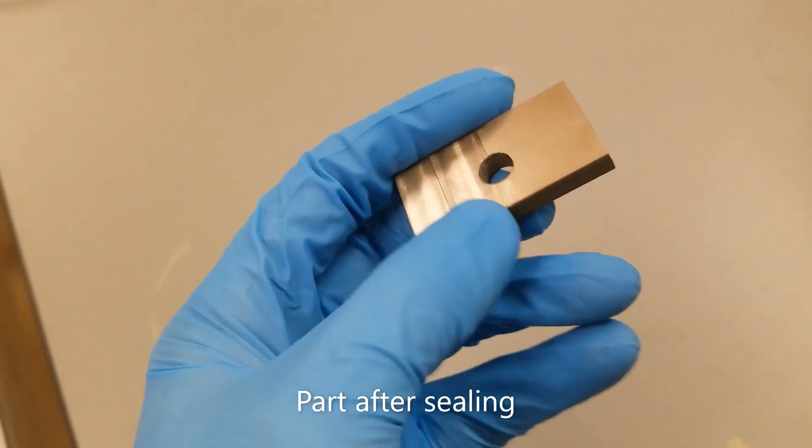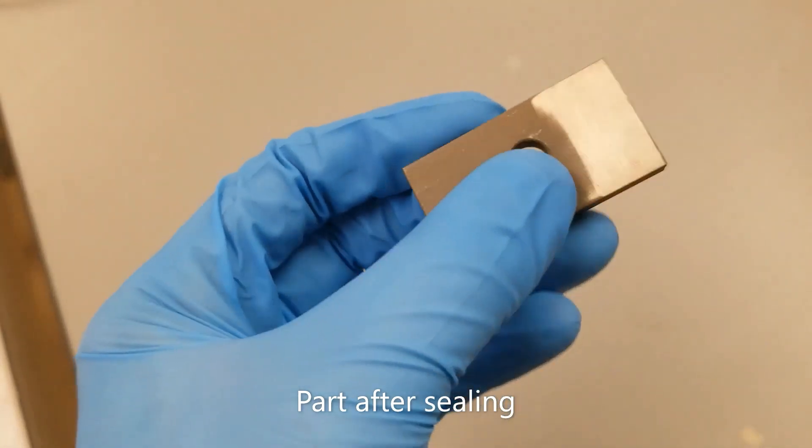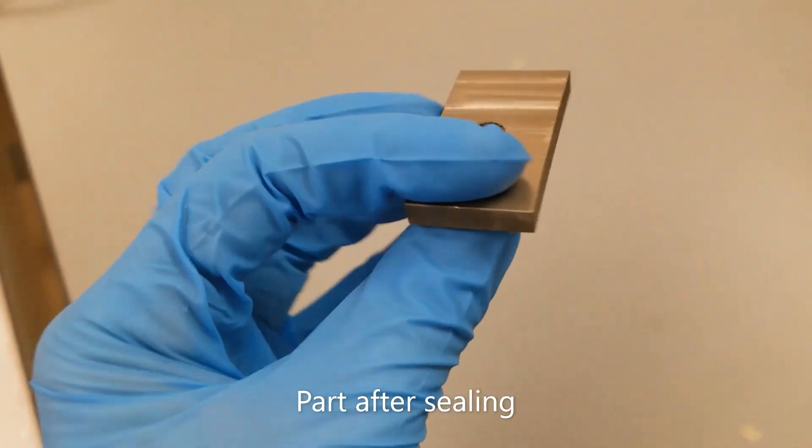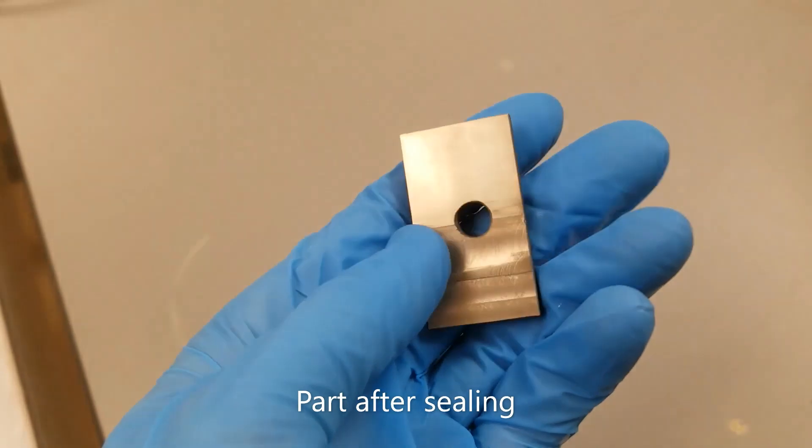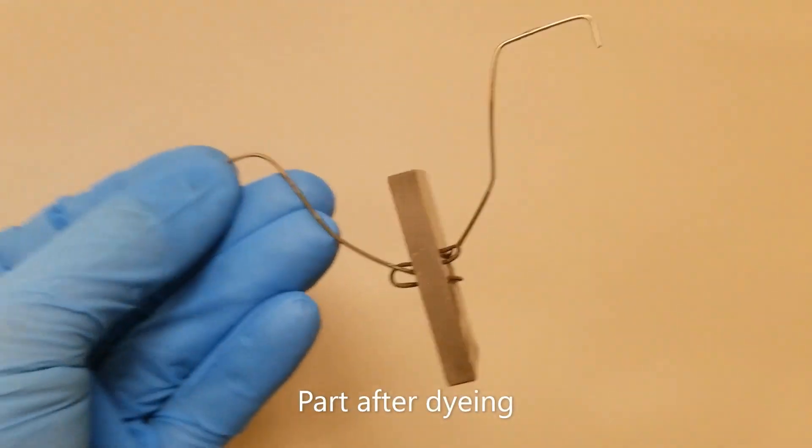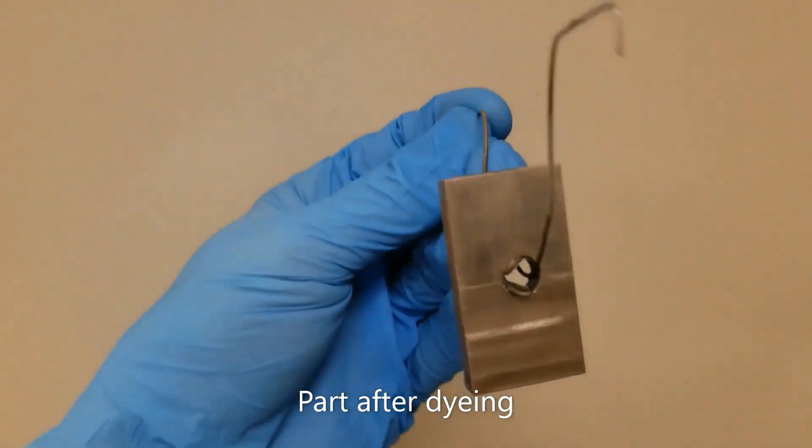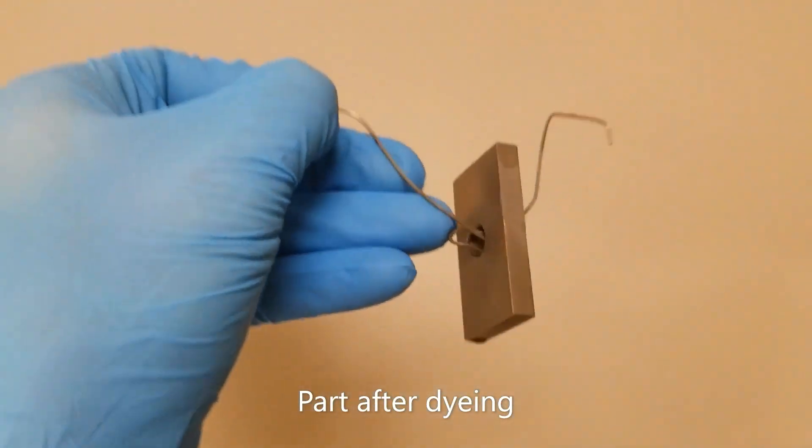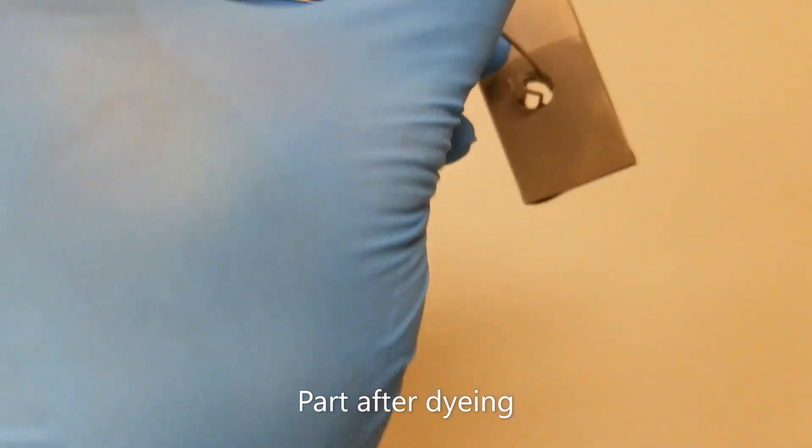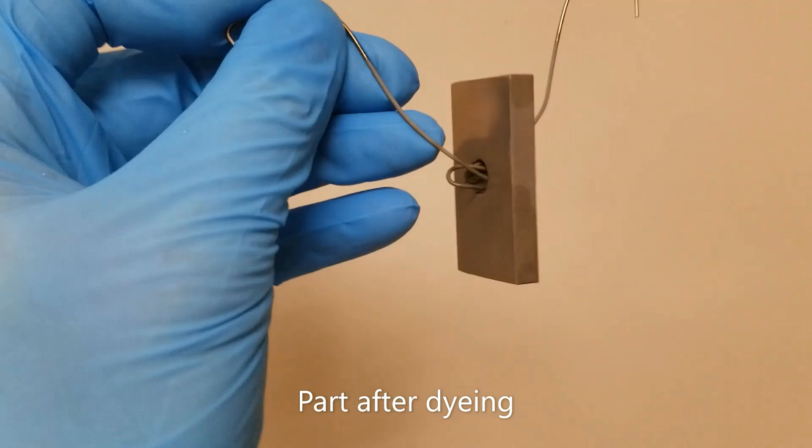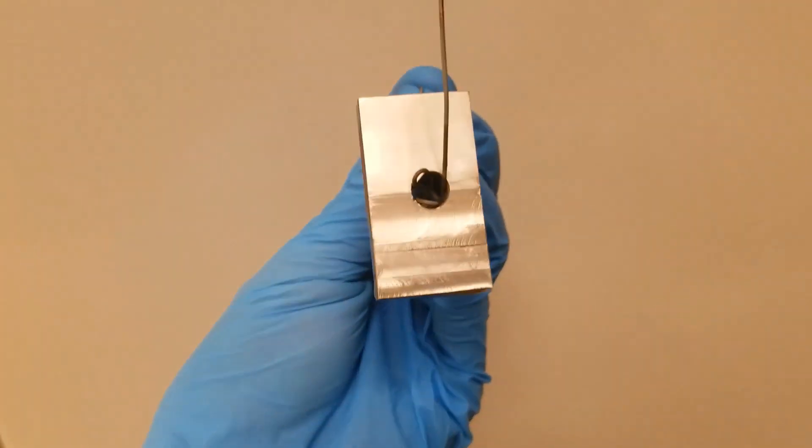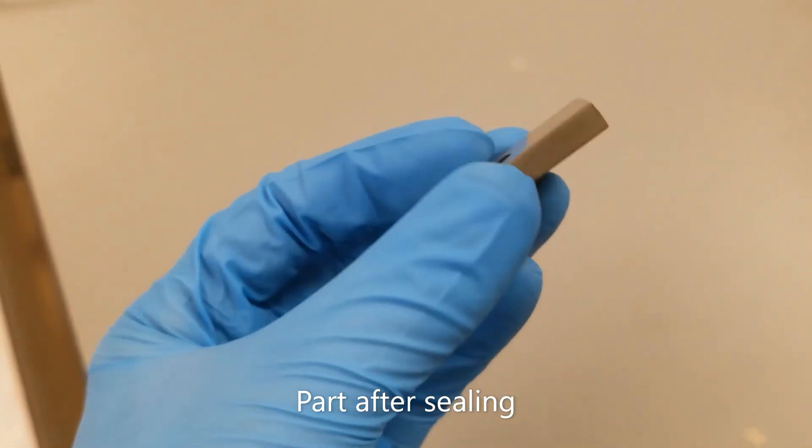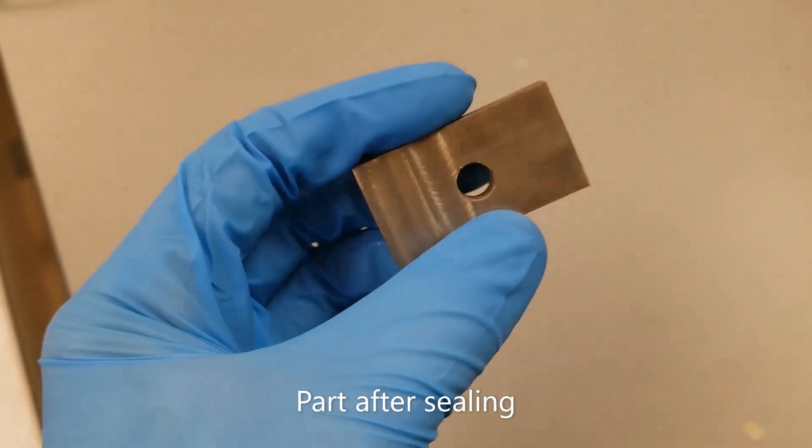So there are some good learnings during this process, mainly that it is relatively straightforward and not too difficult. My process seemed fine in terms of mixing chemistry, agitation, and heating. I found that if I was careful it was easy to keep the part clean to prevent surface finish issues. While my color did not come out right it was certainly uniform, so that's good. I need to be a little bit more careful when I hang my parts on titanium wire to make sure I have a good electrical connection that will continue to be a good electrical connection throughout the long process. And while this result is not what I was hoping for in terms of color, I did what I set out to do and that was anodize a small aluminum part, so I'm going to call this a win. Now if anyone who has experience with anodizing wants to share any tips or tricks, or has any other ideas why I was not able to get a darker black color, please do share in the comment section below.